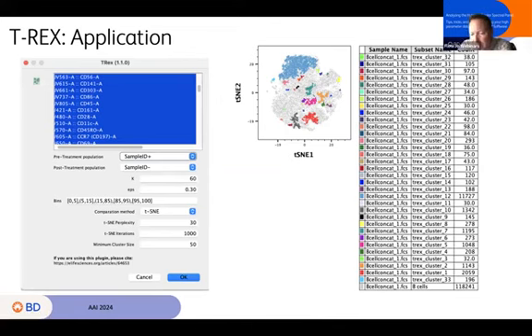And so when I applied T-Rex to the 50 color data set, I started by picking out some of the subsets. It's up to you how you would like to apply these tools, but I will suggest that if you just feed it all of the data in a collected set of PBMCs, then what you're mostly going to find is really macro level differences in large phenotypes. And that's fine. If that's what you're looking for, then awesome. You can totally use it for that.